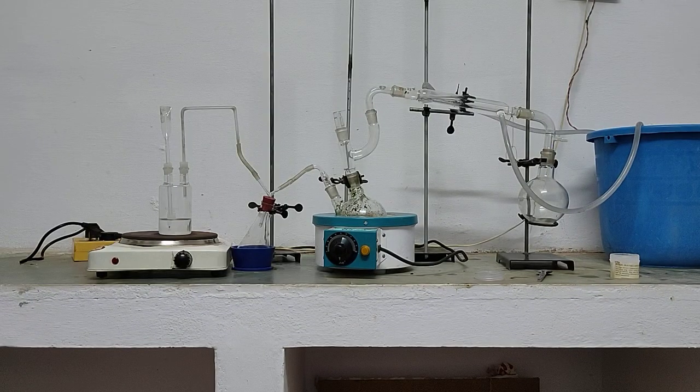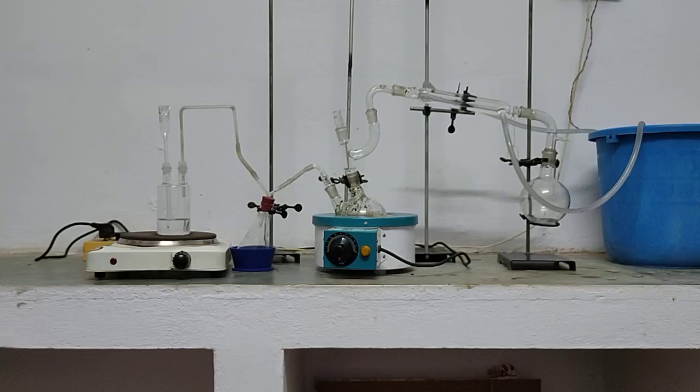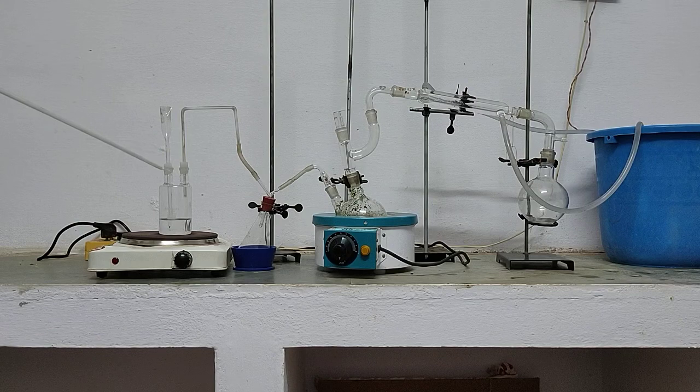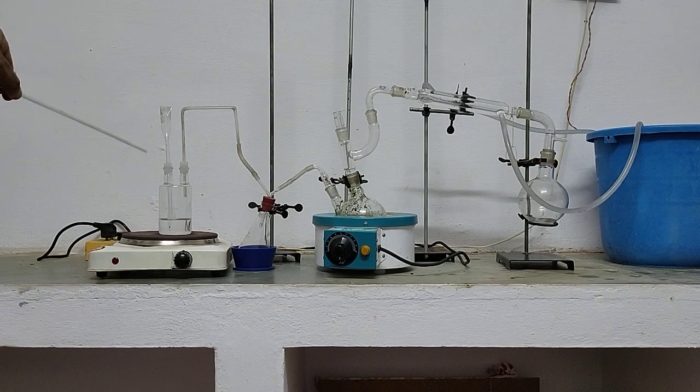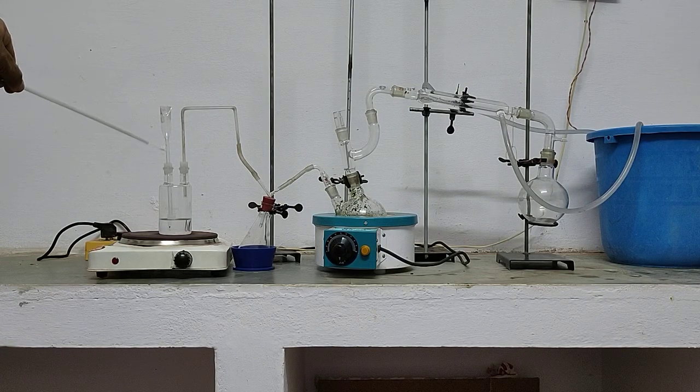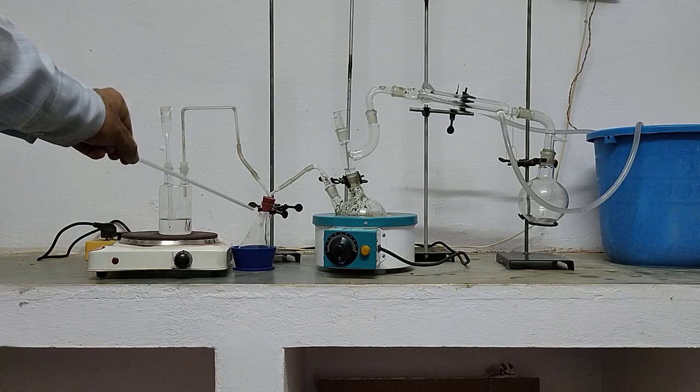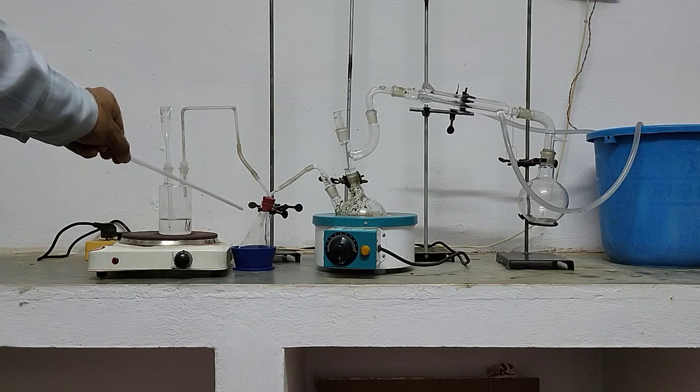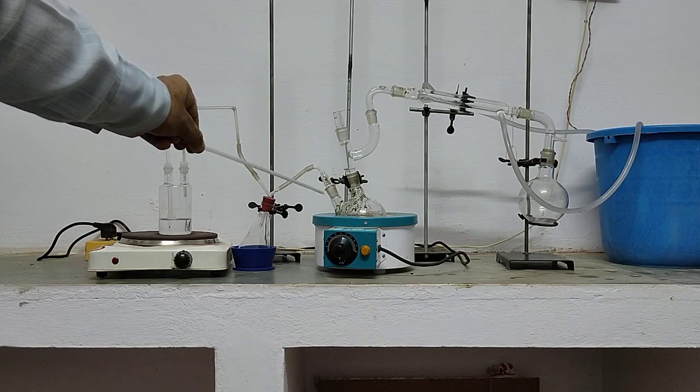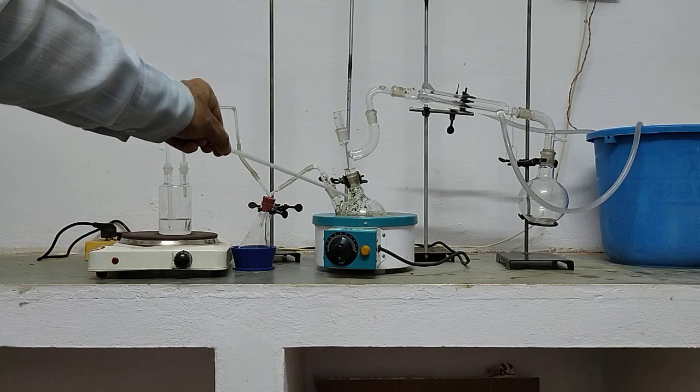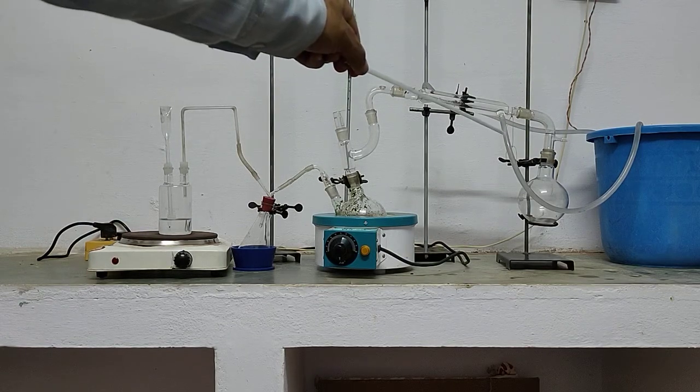Switch on the steam distillation. Start the steam generator. The setup includes a safety rod, steam tube, round bottom flask, water condenser to condense steam, and receiver flask.